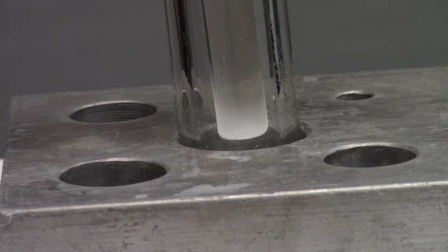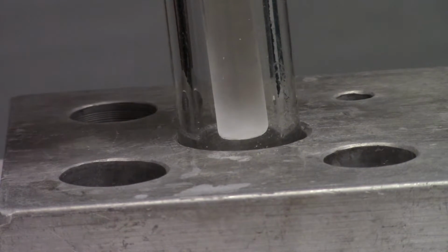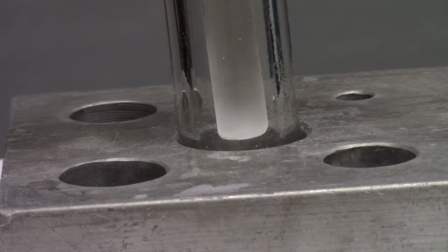All right guys, as you can see, a bunch of white stuff has made its way onto the cold finger. So I'm just going to turn off that noisemaker. There's quite a bit of sublimation that's happened here, which is kind of neat. So let me see if I can show this to you without burning myself too badly.